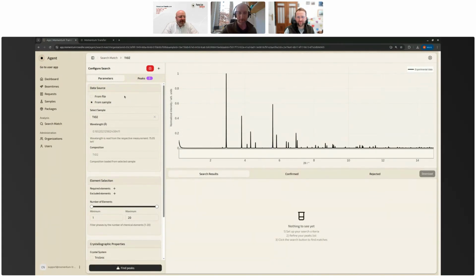So then one question was about Portland cement, if the COD has that. I'm happy, Pascal, for you to send us samples and you can try. Portland cement has a lot of common minerals in it. So I'm sure you can find lime in the COD.